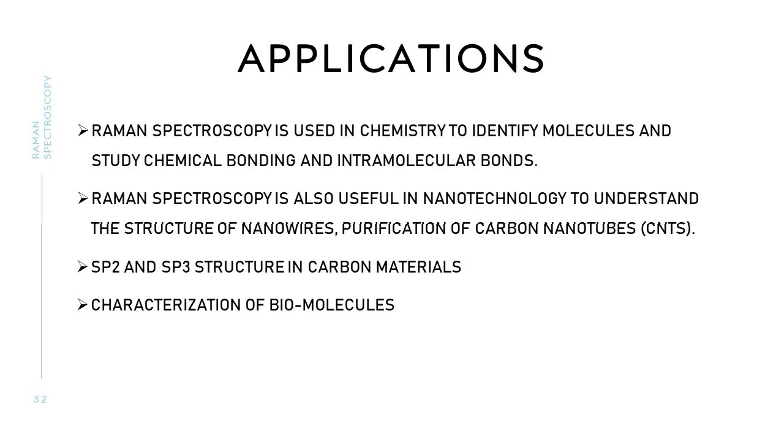Now coming to the applications. With the help of Raman spectra, we can analyze homonuclear molecules, for example H2, N2, O2, very accurately. Triatomic molecules, for example H2O, SO2, NO2, CO2, etc., can be studied by Raman spectra, along with the structural nature of the molecule.